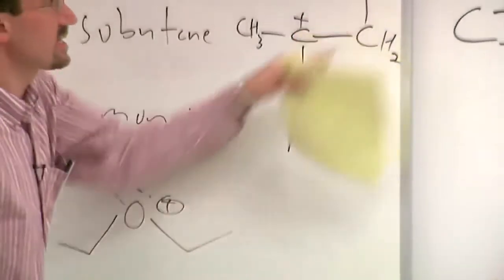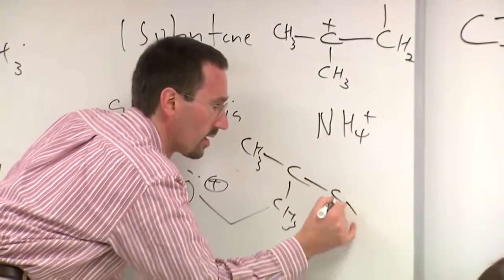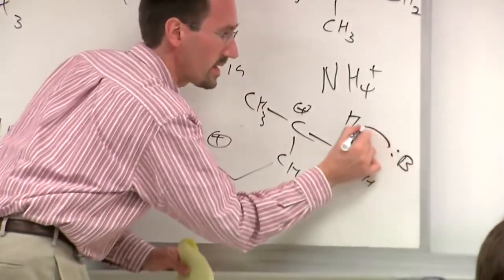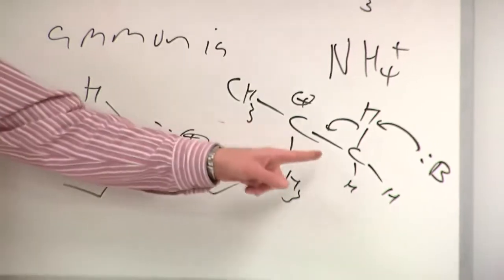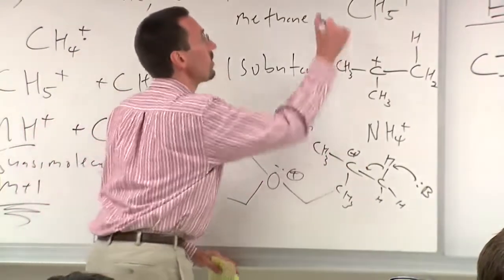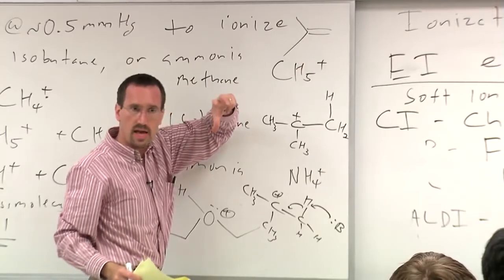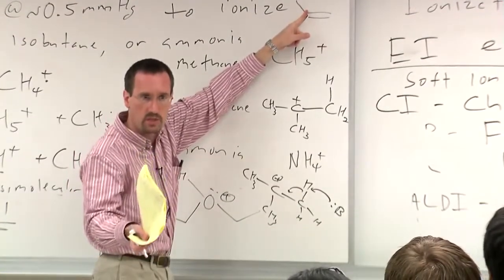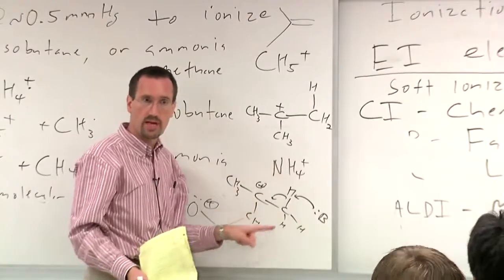You see the M+1. For isobutane, it looks like it would be one less. So isobutane acts as an acid as well, and I'll draw a curved arrow mechanism. I'll just draw this as base. The base takes off the proton. And this is exactly the microscopic reverse of the reaction that you get when you protonate an alkene. So you end up with isobutylene and BH+. And if you think about it, if you protonate isobutylene with a strong acid like sulfuric acid, for example, in a Friedel-Crafts reaction, the first thing you do is you put a proton here, you get a tert-butyl carbocation. So this is just the microscopic reverse of that process.